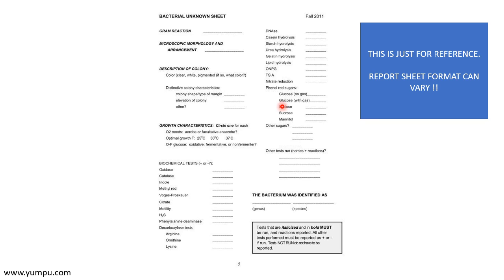You have to go through the list and try to perform at least 10 to 15, even 20 biochemical tests. It may happen that some of the reagents or materials required for a particular biochemical test are not available in your lab. You can omit that, but it doesn't mean you omit all and do only the easy biochemical tests. That's a very wrong approach.